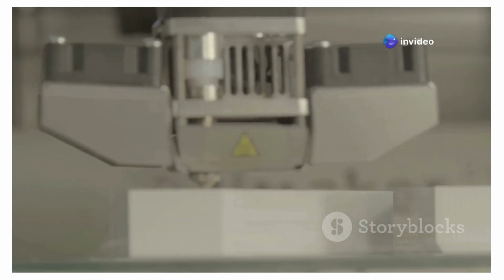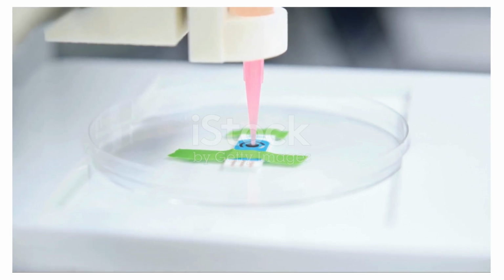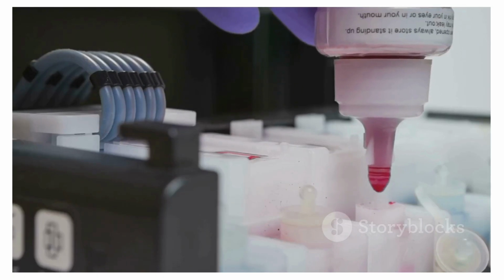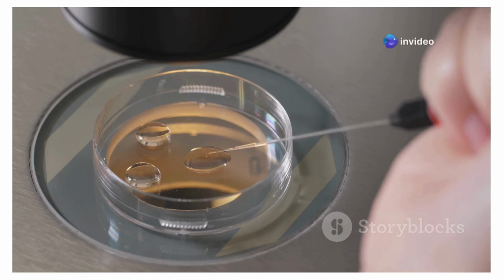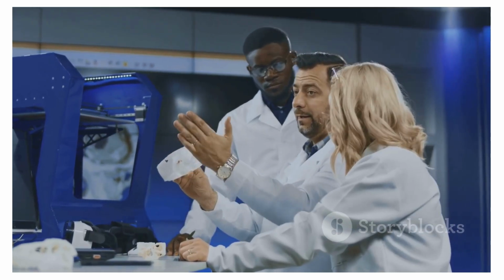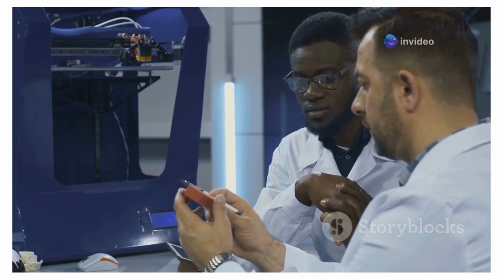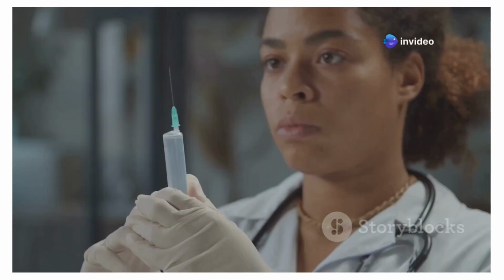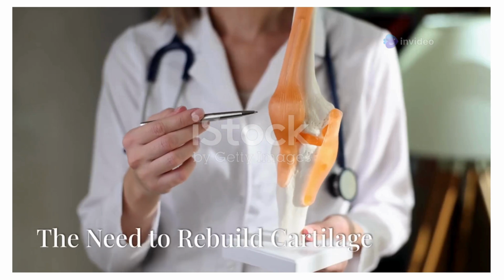Bio-ink, the ink of life. Bioprinting is like three-dimensional printing but for living tissues. It uses a special ink called bio-ink. Bio-ink is a mixture of living cells and materials that support them. This ink is used to create structures that can grow into real tissues. Bioprinting holds immense potential for medicine. It allows us to create tissues and organs in the lab. These tissues can be used for transplants, drug testing, and studying diseases. Bio-ink is the key ingredient that makes all this possible.